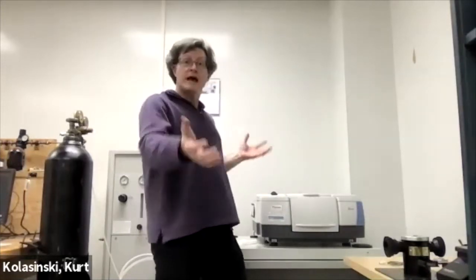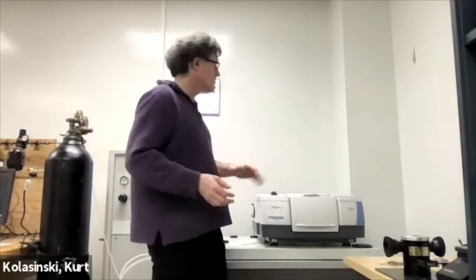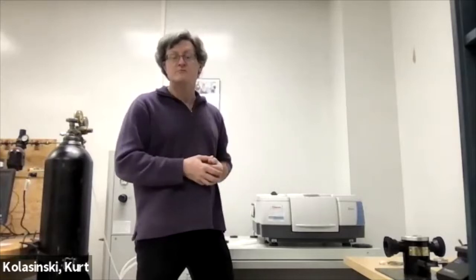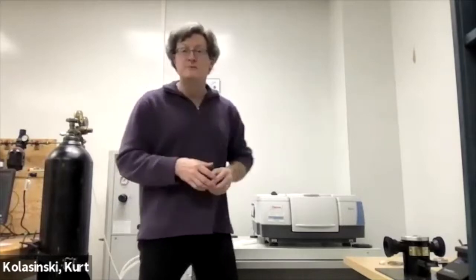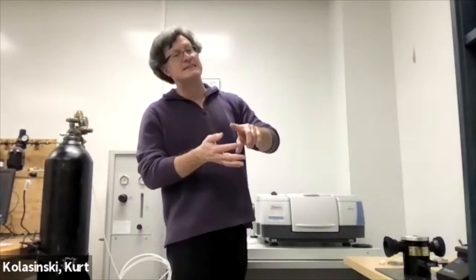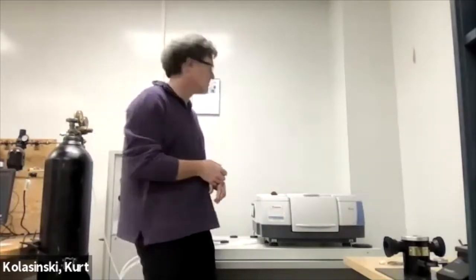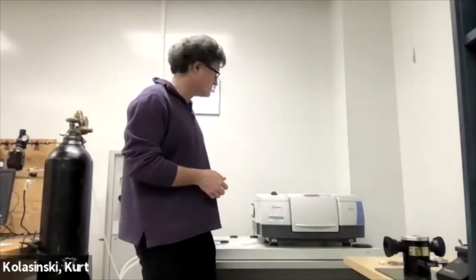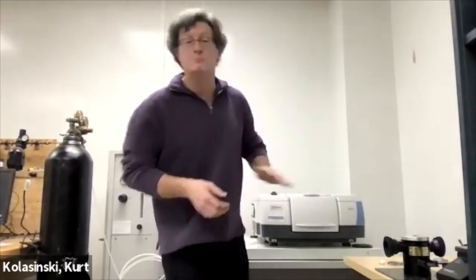Now, we don't have to scan in frequency because we get all the frequencies at once in the FTIR. But very often, the signal to noise isn't good enough if we just take one spectrum, and we're going to average them over and over. In the old days, because of the way they did Fourier transform, you always had to take a factor of 2 spectra: 2, 4, 8, 16, 32, 64, 128, right? You don't have to do that anymore, but still very often you'll see that people use a multiple of 2 in the number of spectra that they take in an FTIR, just out of habit. Convention.